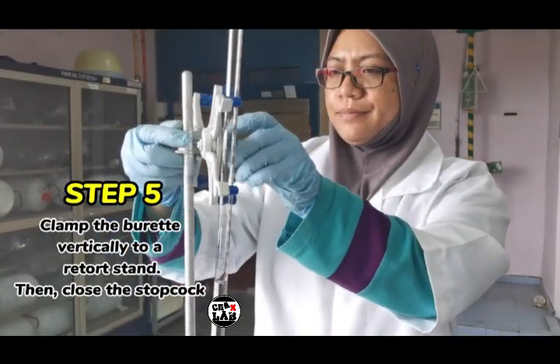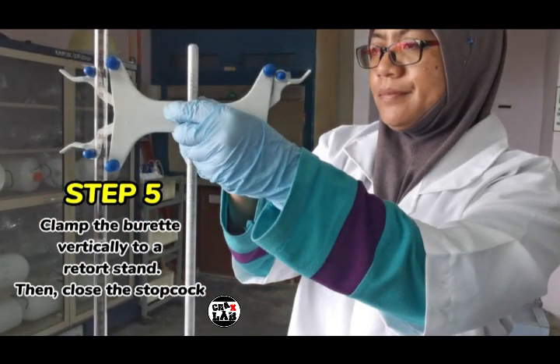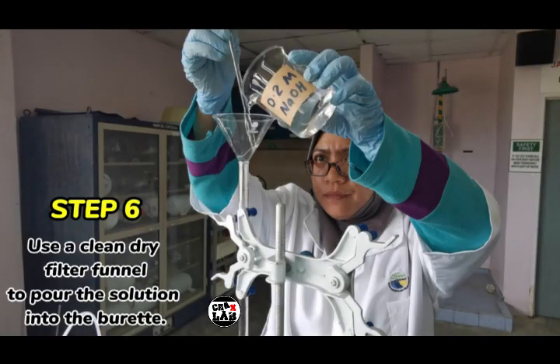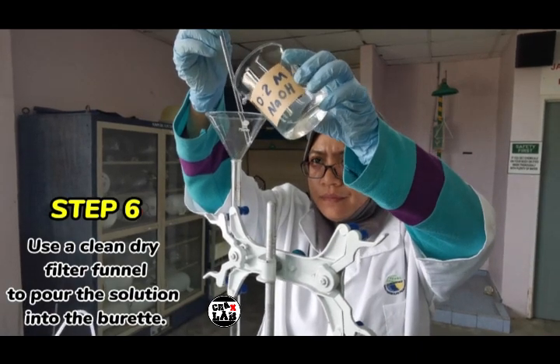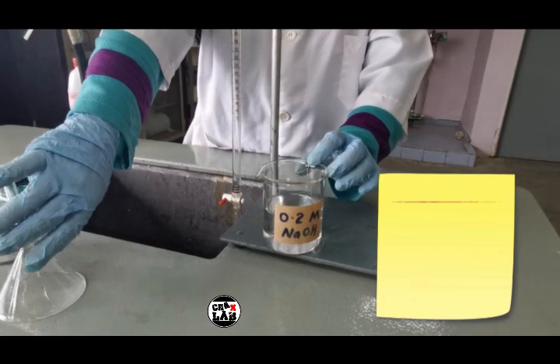Step 5. Clamp the burette vertically to a retort stand, then close the stopcock. Step 6. Use a clean, dry filter funnel to pour the solution into the burette. Remove the filter funnel from the burette.